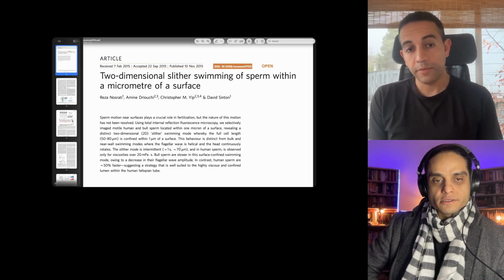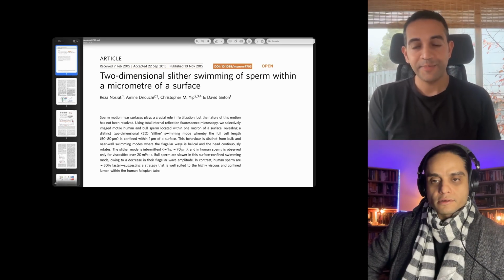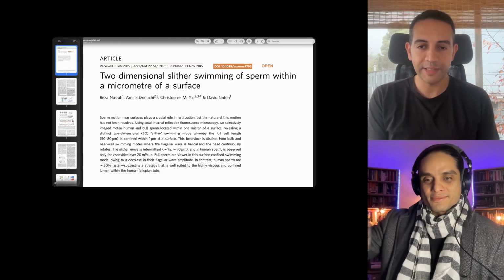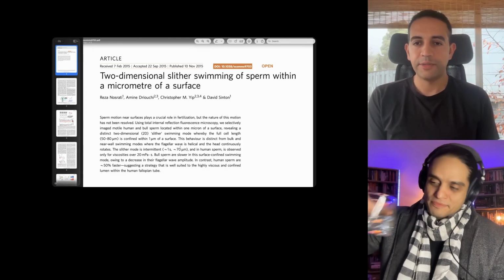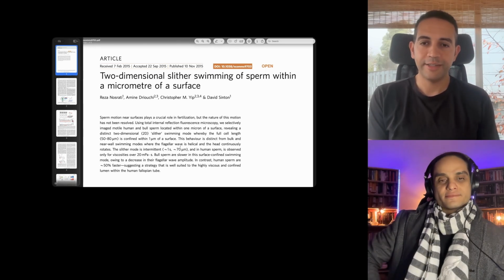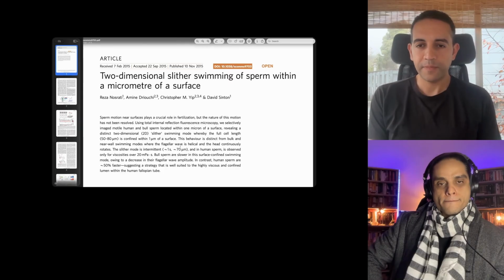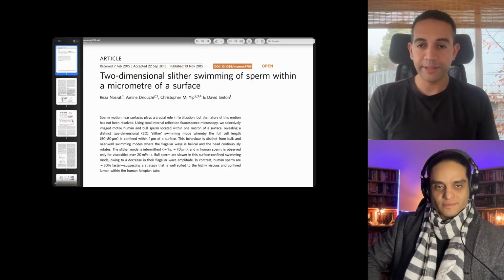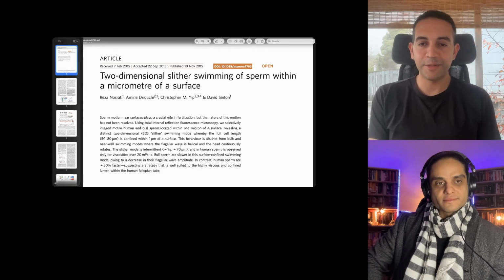I see. In my case, what it meant is when Reza showed up with samples, I had to make sure that the microscope operated the same way each and every day. It was a great introductory exercise during my PhD, because it was simply make sure that the lasers are what they're supposed to be, measure the power every day, make sure that the TIRF angle is what we had last week.